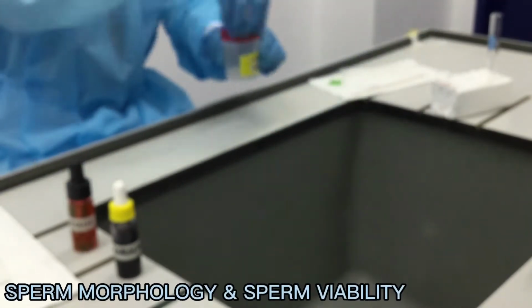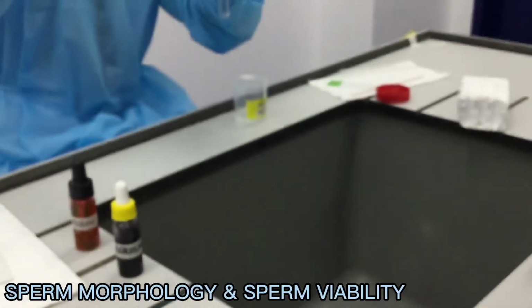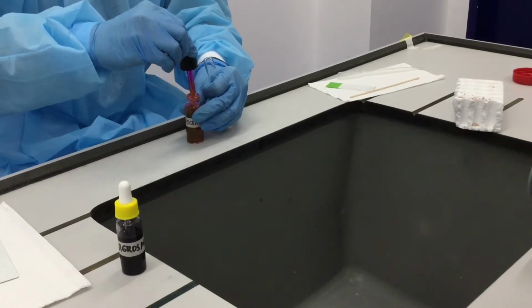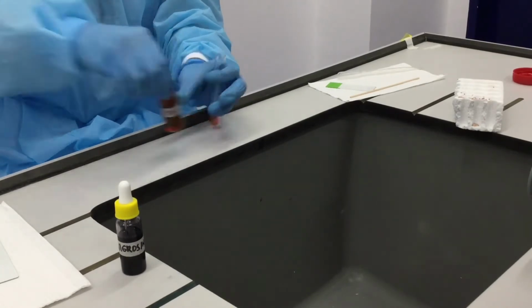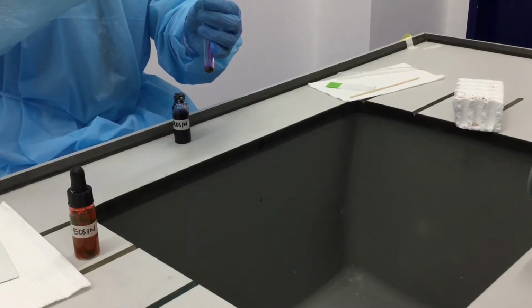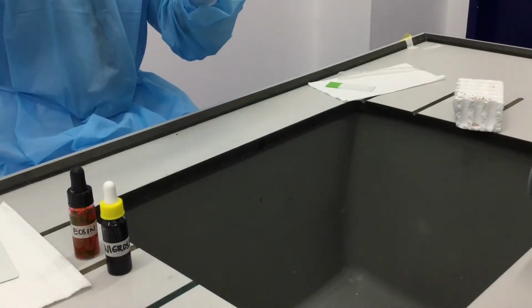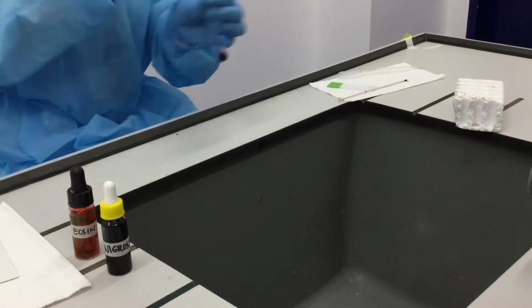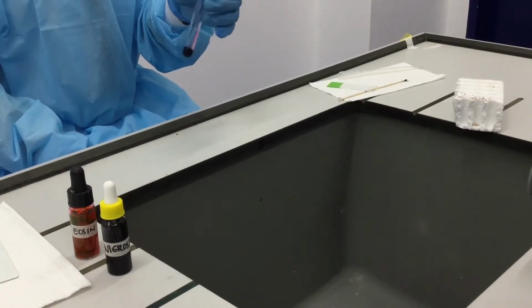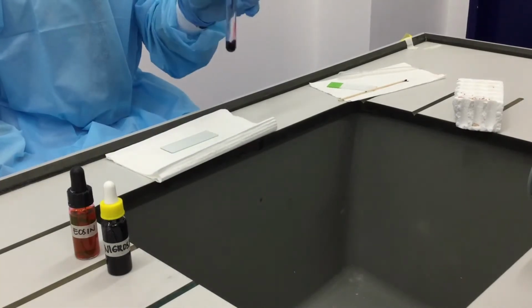In the preparation of the smear for sperm morphology and sperm viability, make a sample solution. First, place 1 drop of semen to a test tube. Then, add 2 drops of eosin stain and add 2 drops of nigrosin stain to the tube. Mix the sample and stains using an applicator stick. After mixing, let it stand for 1 minute.